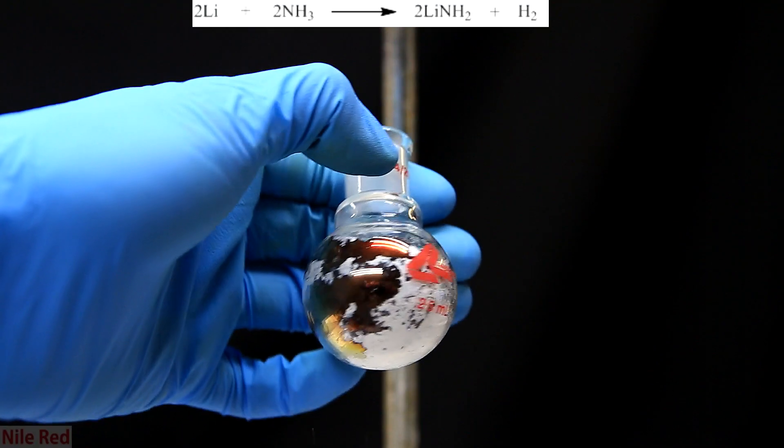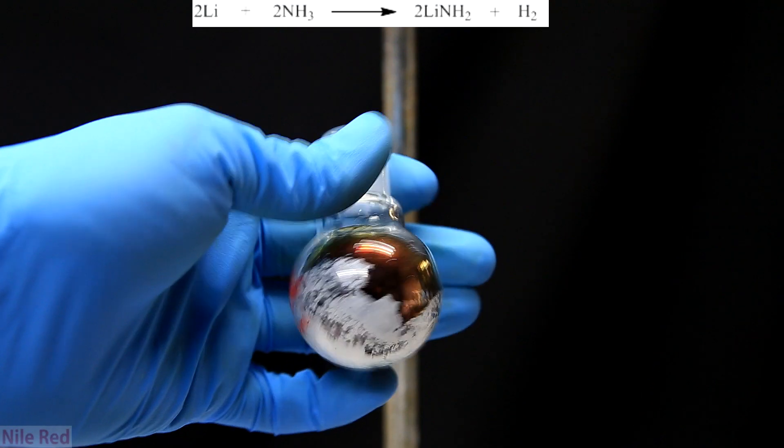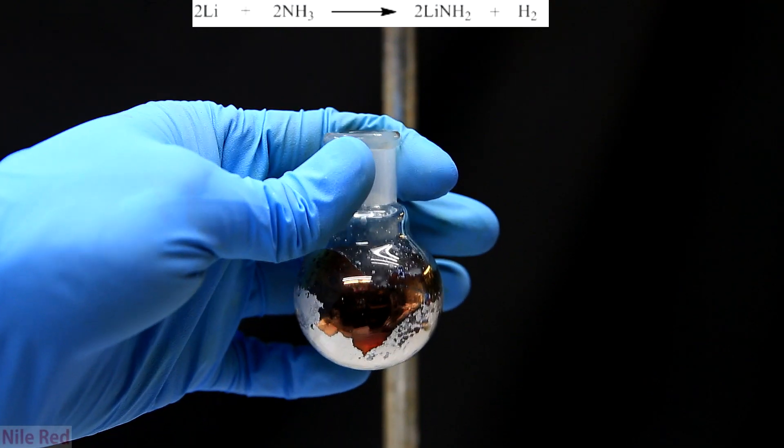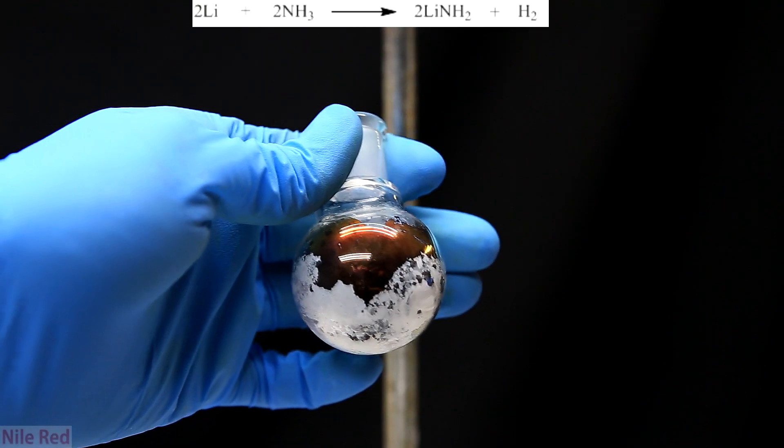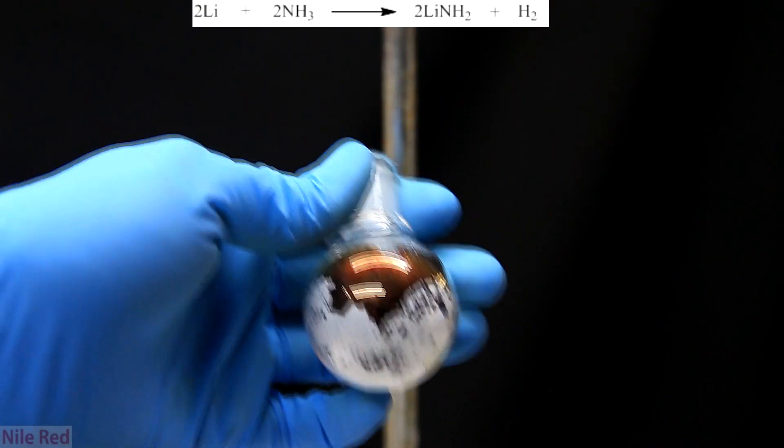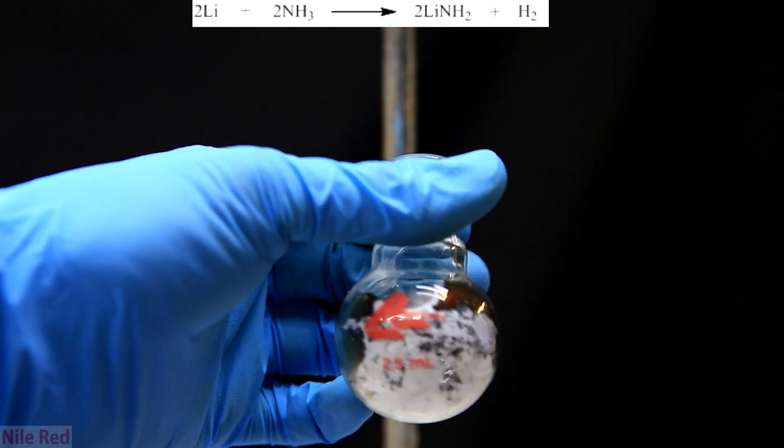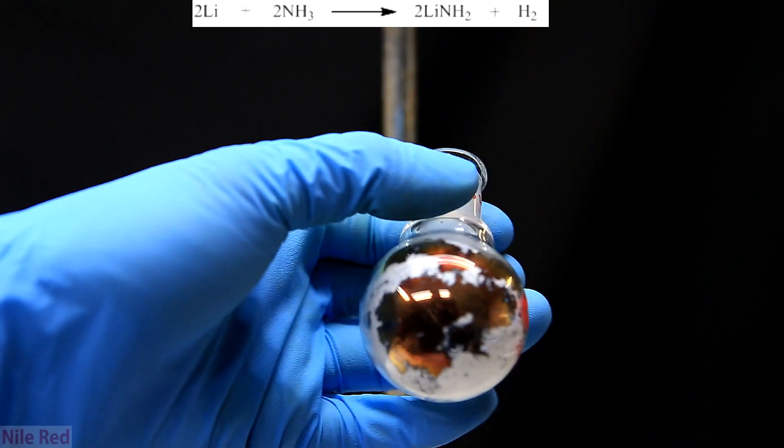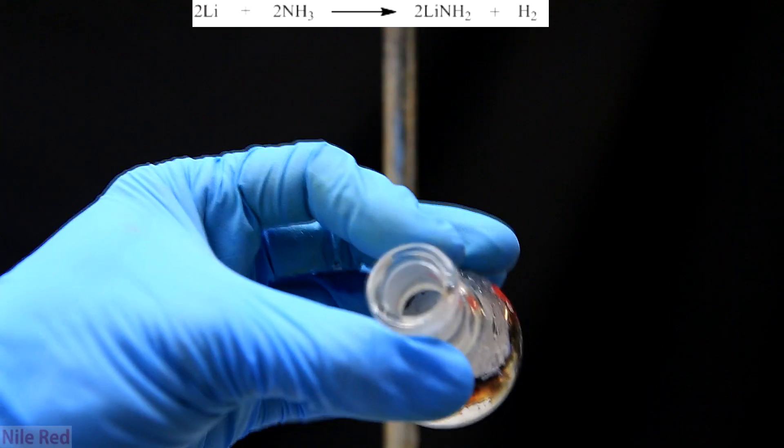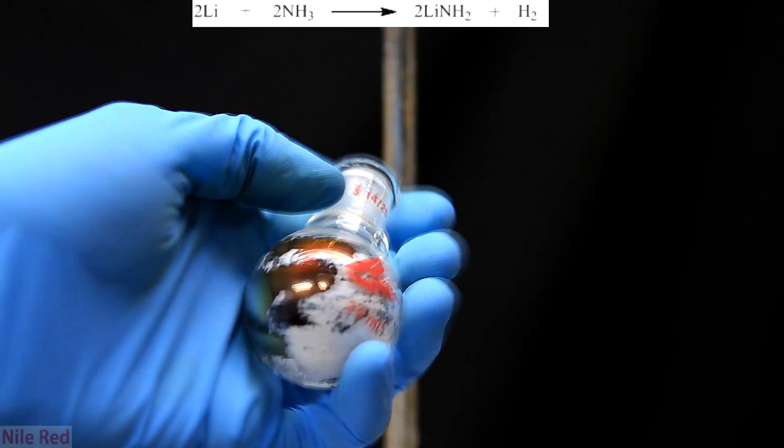Most of the white solid that you see is actually lithium amide. Unlike sodium, when lithium is added to ammonia, it very quickly forms the corresponding amide. When the ammonia evaporates, the salt will crystallize out. Some of the white powder is also formed when lithium reacts with CO2, water, and oxygen in the air.